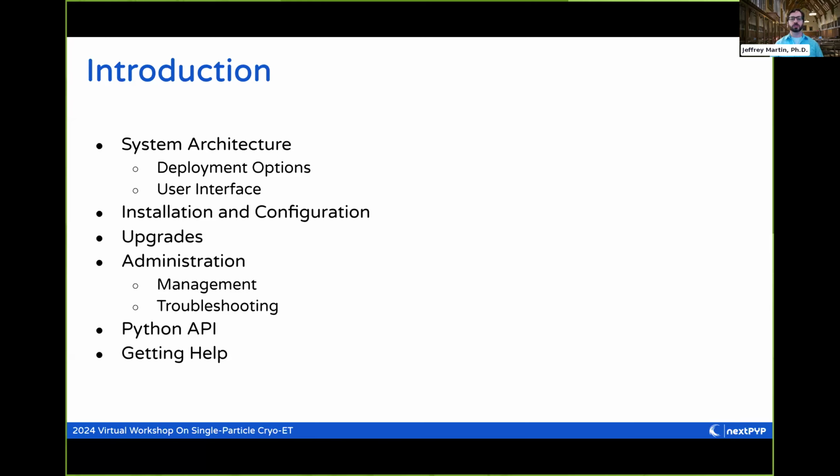I'm also going to talk about the user interface, how to find features within the software and its interface. I'm going to talk briefly about not necessarily how to install our software, just because that can get very detailed and we only have time to do a high-level overview here. But I'm talking about what are the options you have during installation and how to find instructions for going through that process, and also configuring our software a little bit after the fact.